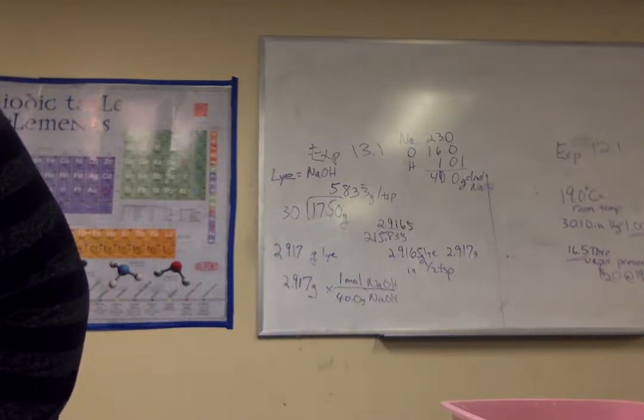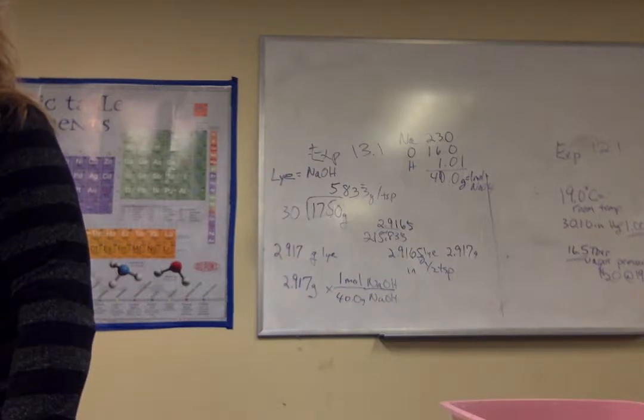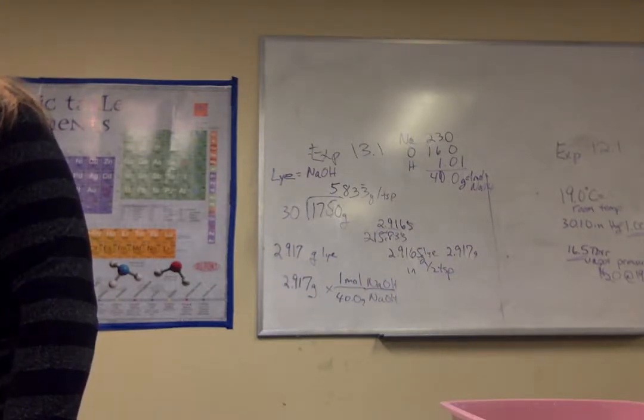The first time I saw 2 consecutive times, but the second time I looked at it, it said take the highest ones. Okay, then it was right. Highest, right before it drops. You go up to the furthest. Okay, so it's 30.3. Yeah, okay, that both share.